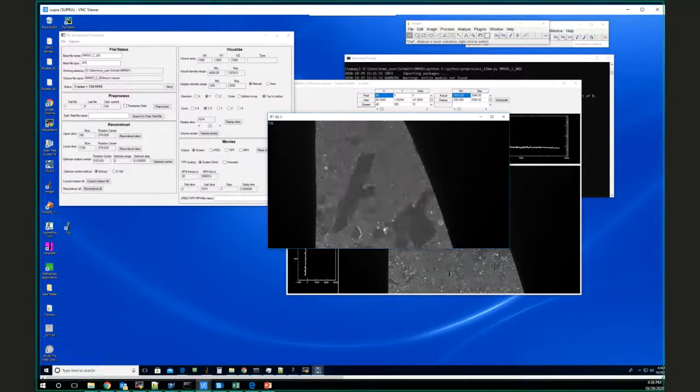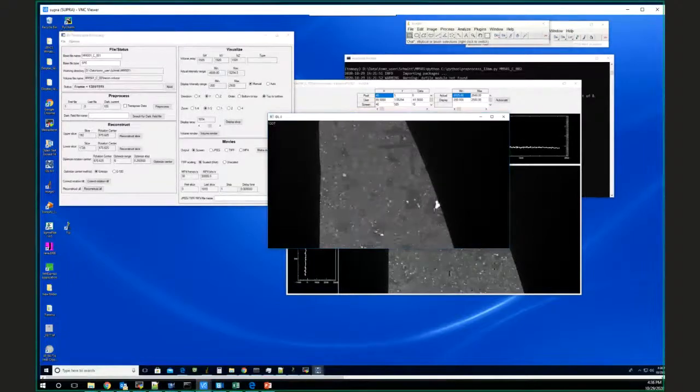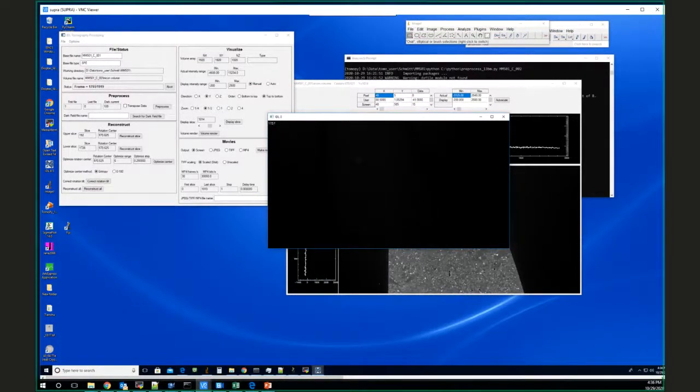That's not pores. This actually looks like a pretty compact sample. I don't see cracks. I don't see much in the way of pores here, because I've looked at this before. This isn't different. And there's a vein in it. Did you see that? It went through. Yeah. And so that's interesting. Is that like a secondary melt or something? I'm not sure.